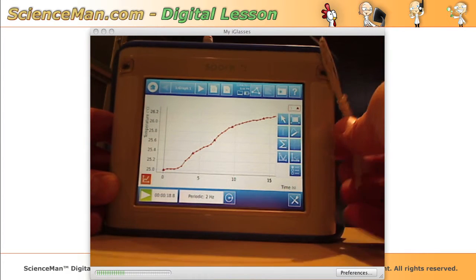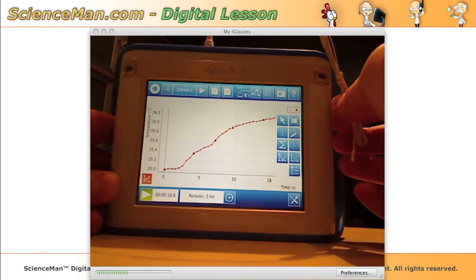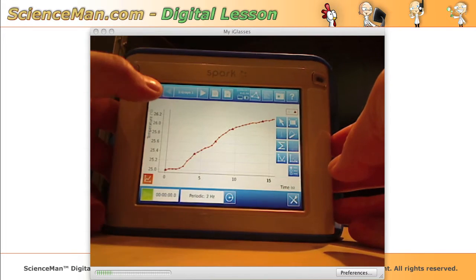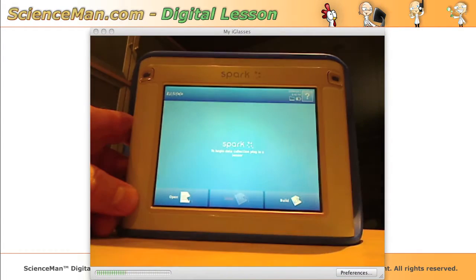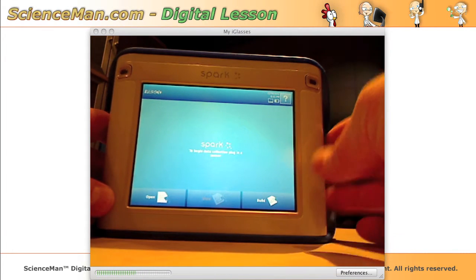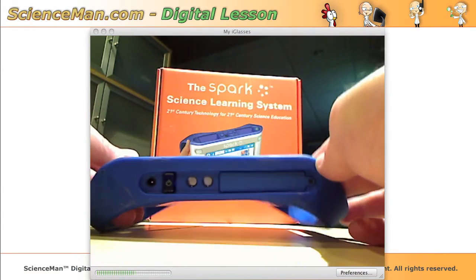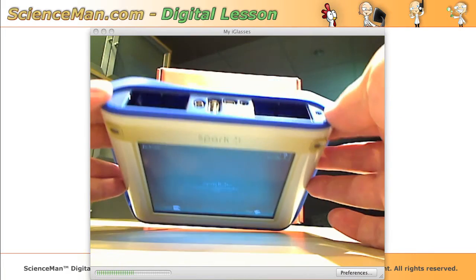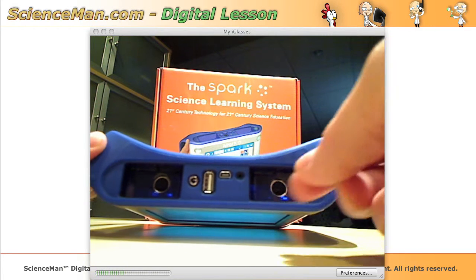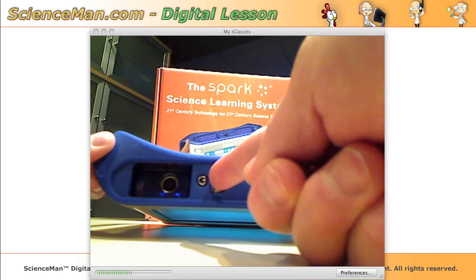We'll unplug that sensor and go back to the home screen — we don't want to save that data. Now let's talk about some of the ports and buttons on this unit. The power button is on the bottom, and at the top we've got a set of ports that make a lot of sense. First, we've got a USB port so you're able to plug in flash drives and save your data there.